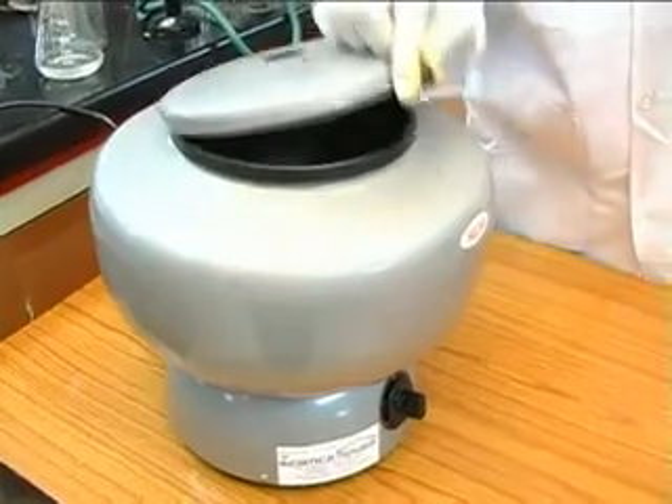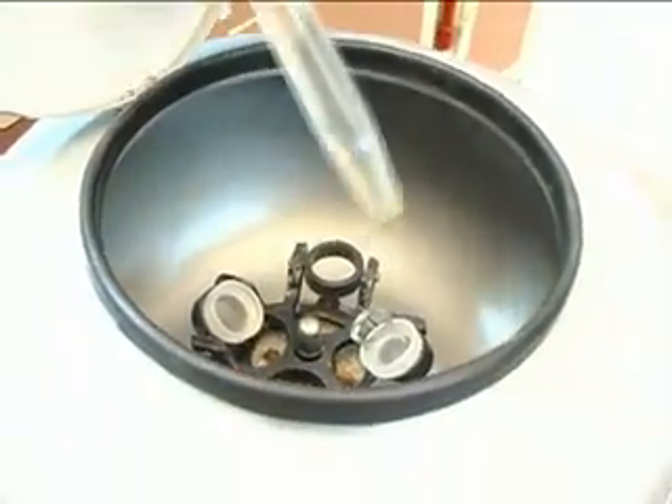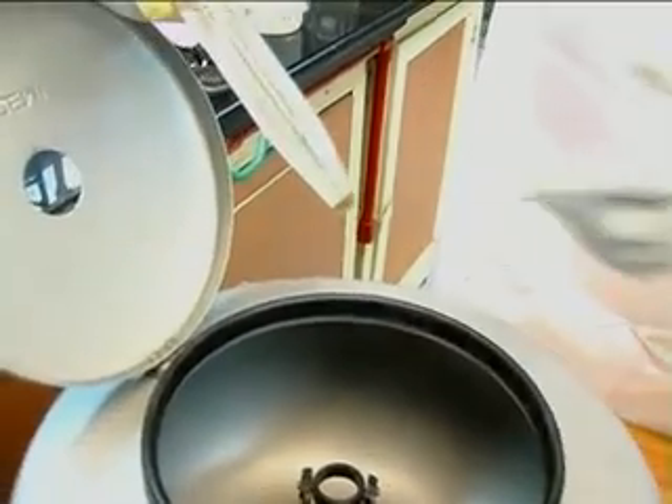After 1 or 2 minutes, when you take out the tube, you see that the solid is stuck to the bottom of the tube and the solution can be decanted.